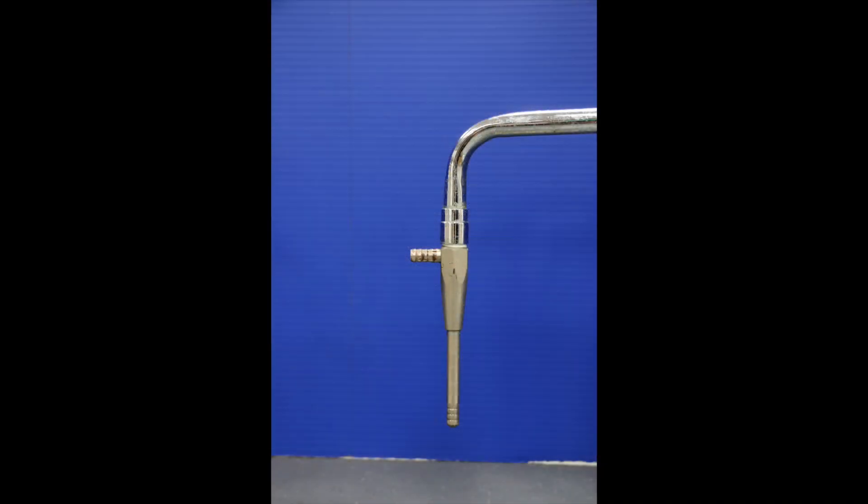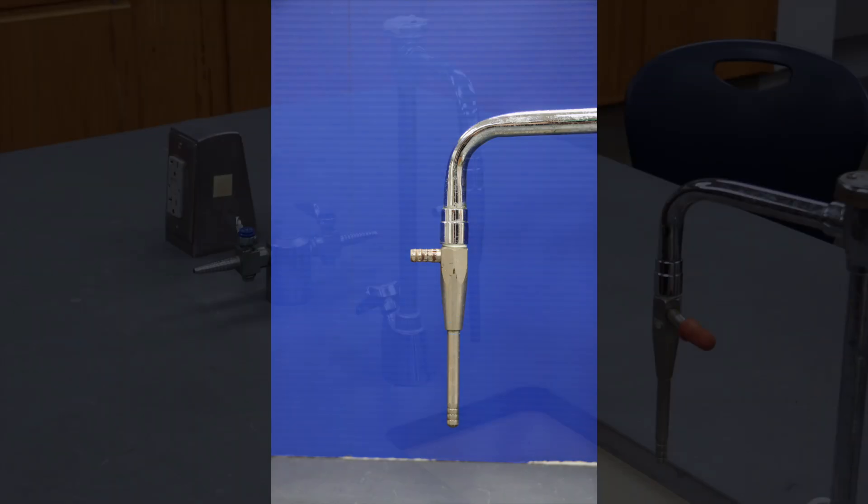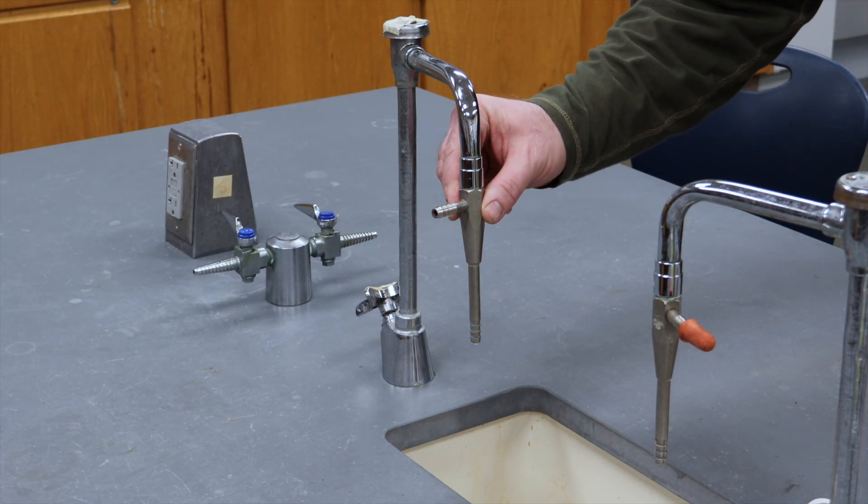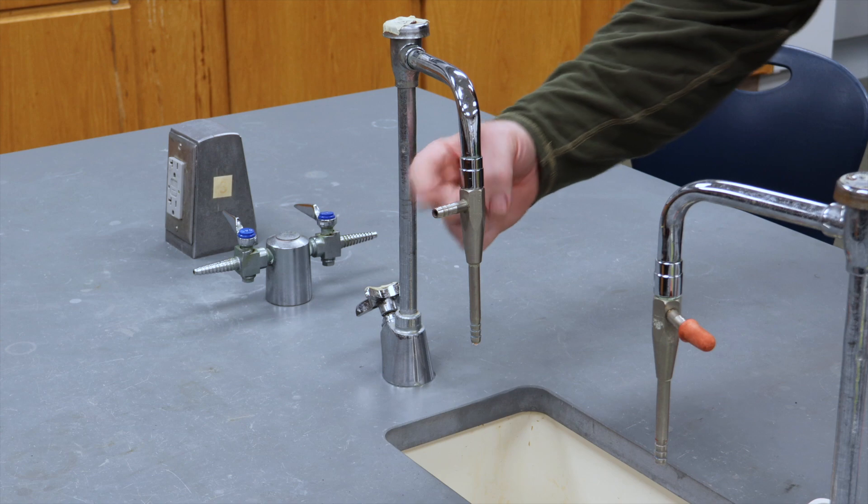In our labs, our source of vacuum is a water aspirator attached to a faucet in the lab benches. When you turn the faucet on, water rushes through the pipes and is constricted in the neck of the aspirator.